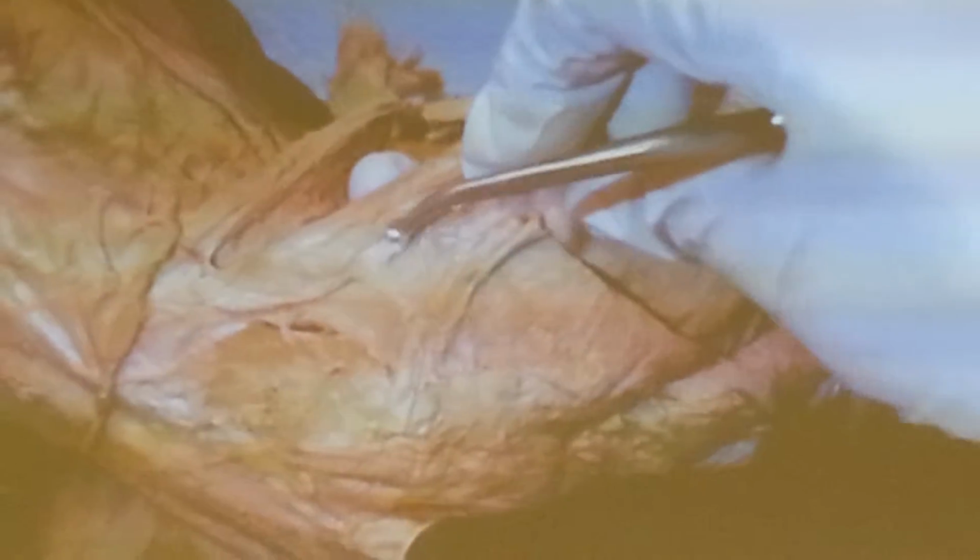And here on the posterior of the thigh, when you look from the lateral side, again you see the fascia lata and then the tensor fascia lata. If it's not open, the first thing you see, the most superficial, is sartorius. When you put it away, you will see tensor fascia lata and fascia lata, and then some other muscles that are a little different from the human. Gluteus muscles in the human cover the whole buttocks area, but here they are a little smaller. You don't need to know this area for the exam.